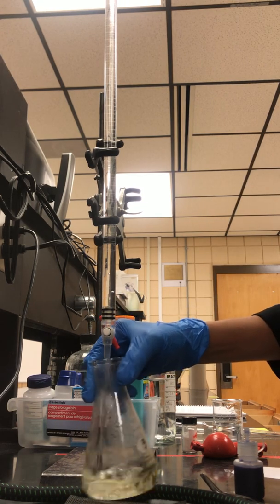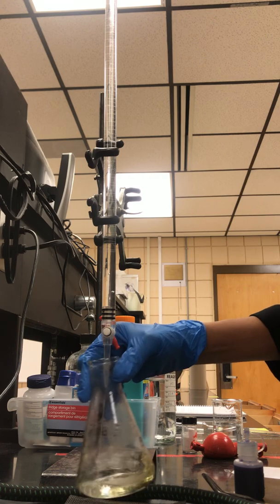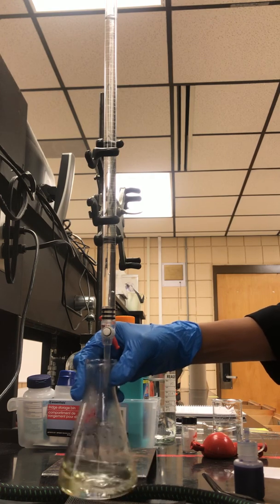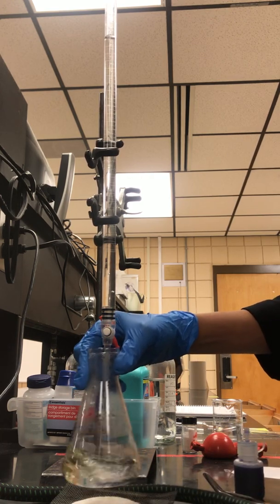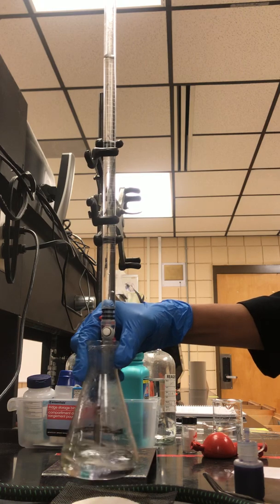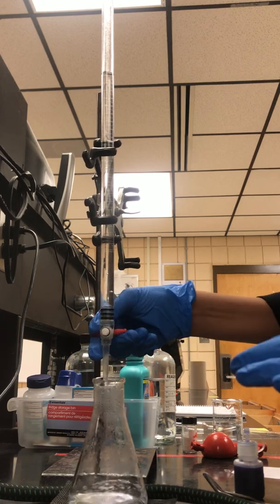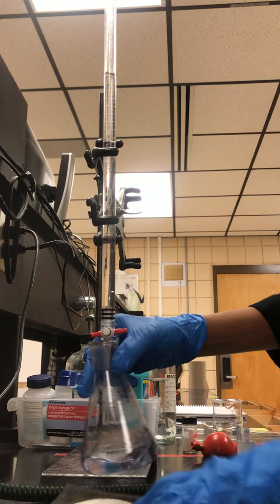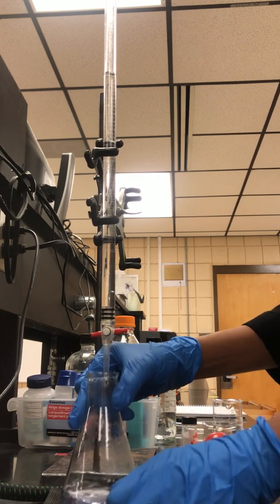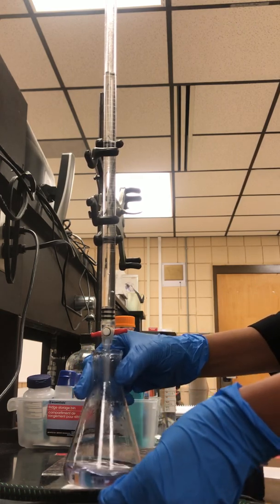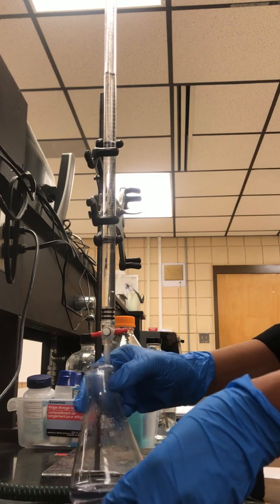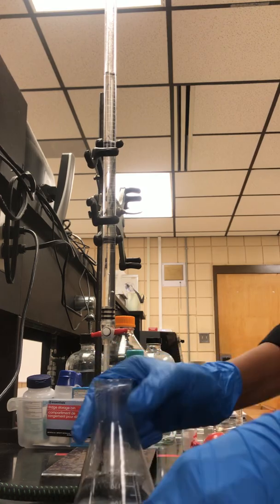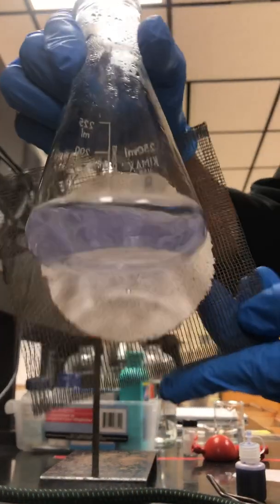We want to just gently turn and swirl until we get a faint blue color. You notice I stopped it because it started to turn blue.